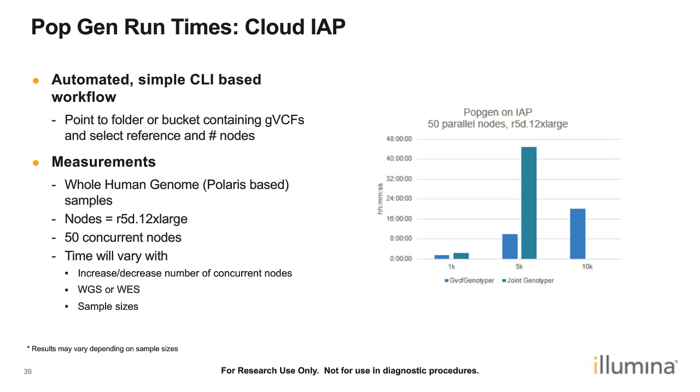And if you are running 5,000 samples, we are looking at about 50 hours, if you look at the two steps, which is the GVCF genotyping and joint genotyping, to run this. And as we are in the process of completing some of the work for the 10,000 samples, as part of this release we are looking at supporting 10,000 samples in a cohort, but the goal is to get into much larger cohorts as these population genomics initiatives start to expand all over the world.